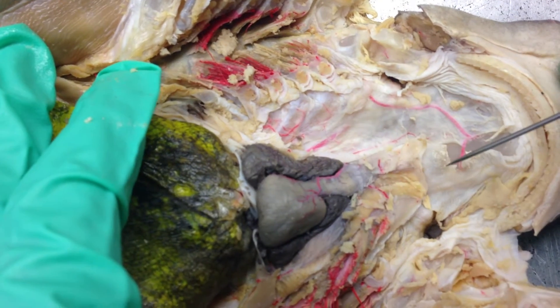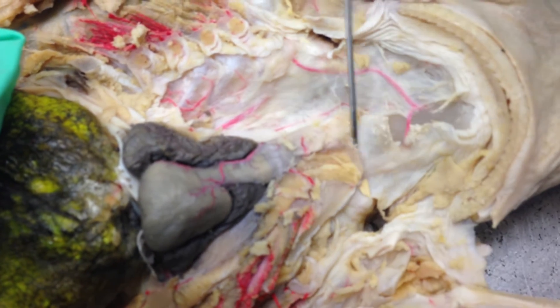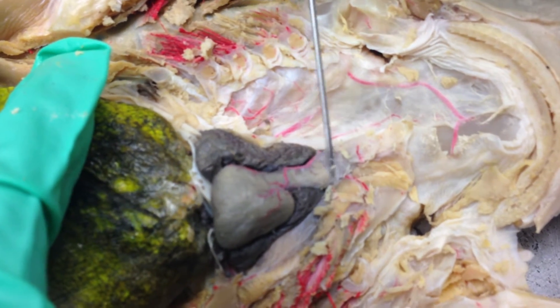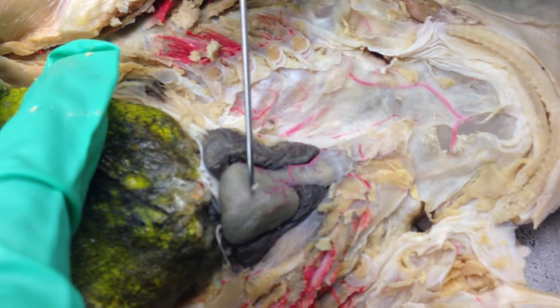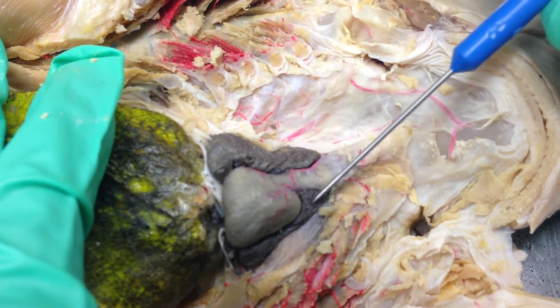The ventral aorta would be right here. Someone who dissected this kind of cut it off, but it would be right here, which would then lead into the conus arteriosus, which is this section right here, into your ventricle, which is right here. And these other two dark gray areas are your oracles.